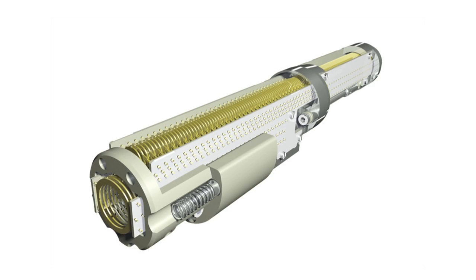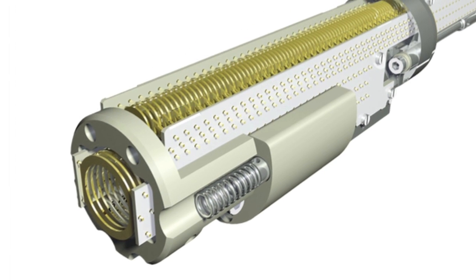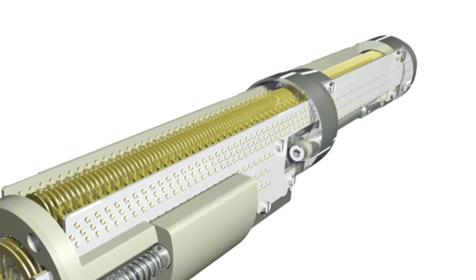The conjoined ion guide in the step wave operates at a pressure of about 3 millibar, and so subsequently we need a further stage of differential pumping before we get to the higher vacuum stages of the analyzer. In this subsequent 10⁻³ millibar region, we use another travelling wave device to efficiently transport ions towards the mass analyzers.